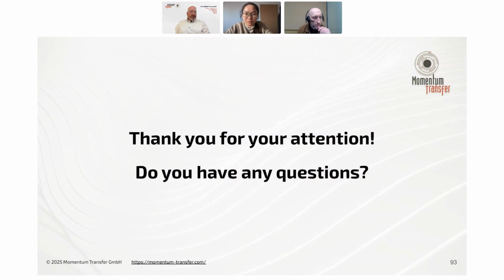One is from Shatanu. What is the maximum spatial resolution possible for X-ray PDF, and what are the methods to improve the spatial resolution? Yeah, good question. So this really depends on to what maximum Q value you can collect data, such that the statistics on the coherent signal are good enough to keep in your data. So for our setup, we collect to about 30 inverse angstroms.